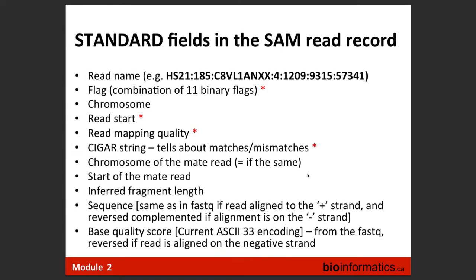And we will do it at the tutorial. We will look into the header of the file. This is a summary of what the fields of the BAM file are. So first is read name. The second is just flag, which is just a number.